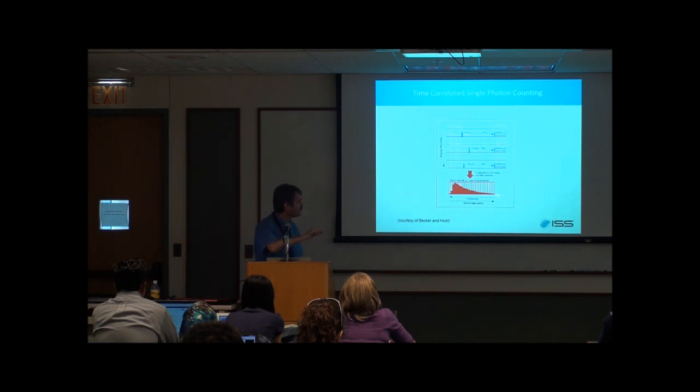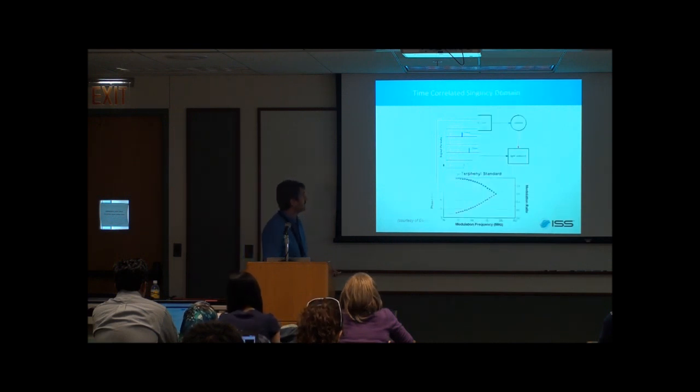We collect about 5,000, 10,000 photons, and so we finish up with this curve. And then we fit the curve and determine the decay time.